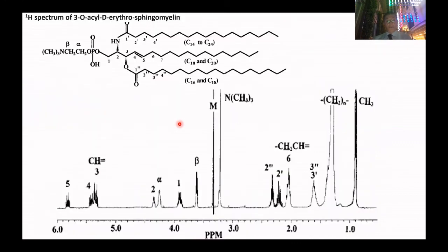The next is the proton NMR of another group of long chain unsaturated fatty acids, but in this case attached also to phosphorus. We call them phospholipids, and you will find them commonly, especially in marine organisms. Now you know how to do the assignment. However, we will do a quick revision with you.